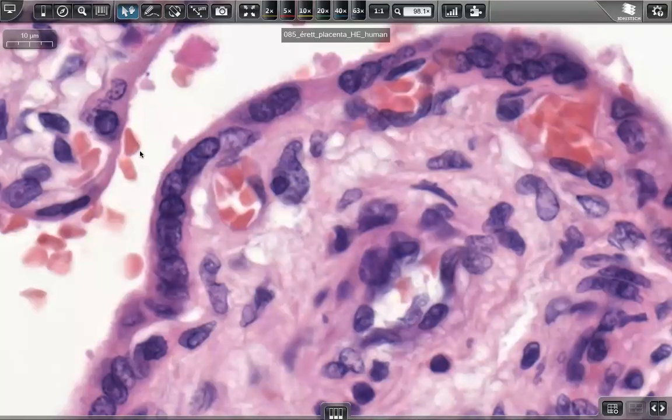Eventually, there's no such a big difference, just the location of the red blood cells. So they belong to the fetal circulation, and the intervillous space having the maternal blood represents the red blood cells of the mother. So these are the maternal blood, the space for the maternal blood. Red blood cells here and red blood cells there, just providing gas exchange through the layers of the villus.